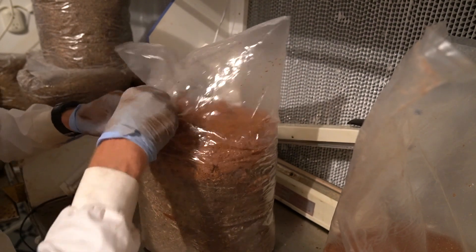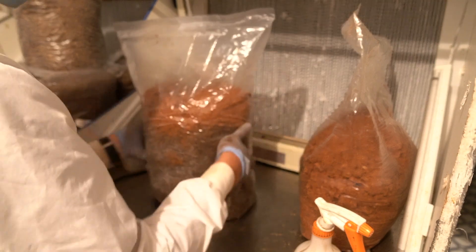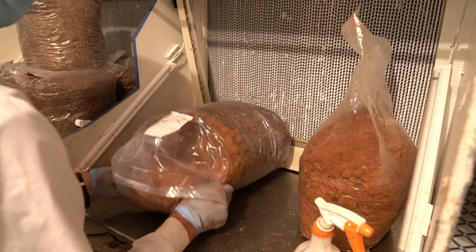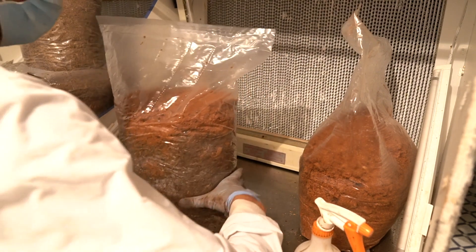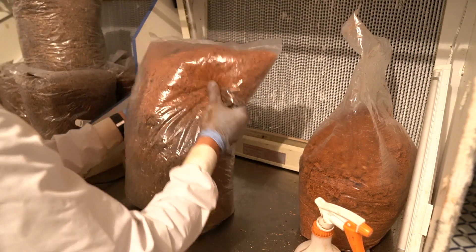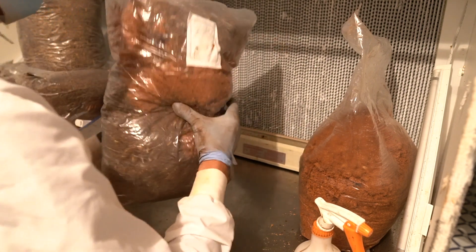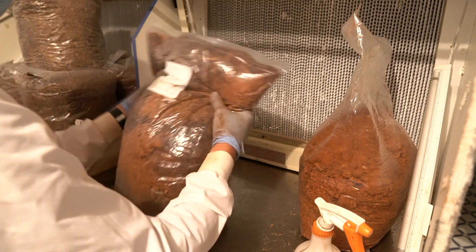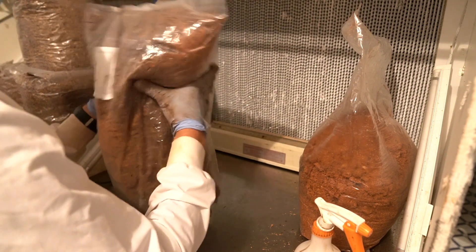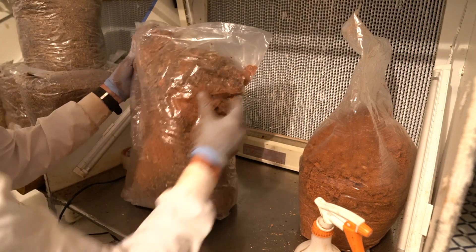You want enough air in there — even though you have filter patches, you want a little micro-environment inside so it has enough air to breathe and not suffocate. Now I'm just breaking up any clumps. The more powdered the spawn the better — you're using a sawdust substrate, so more powder means more coverage. My trick: start from the bottom and work up. Sawdust is more time-consuming to get even coverage than grain; with grain you just flip the bag and you're done. With sawdust I have to really work it — start at the bottom, work up, lay it down, bring it back up, work from the base.